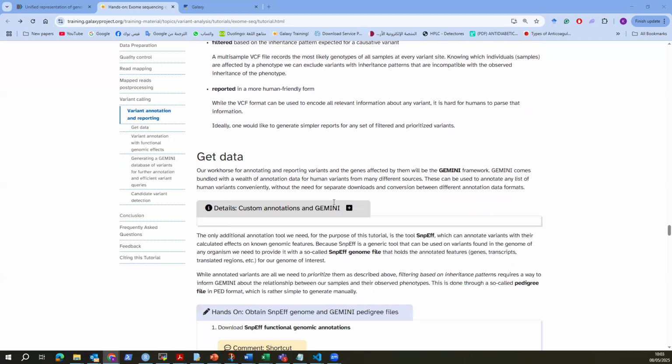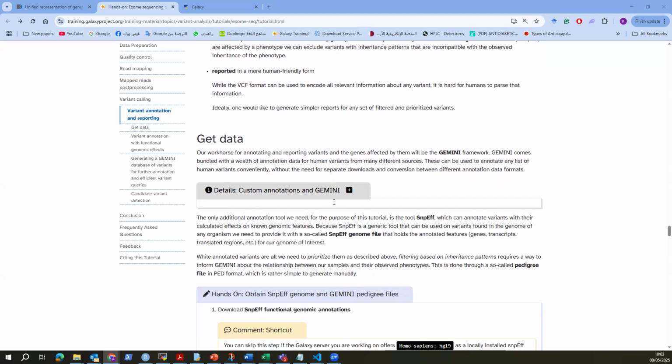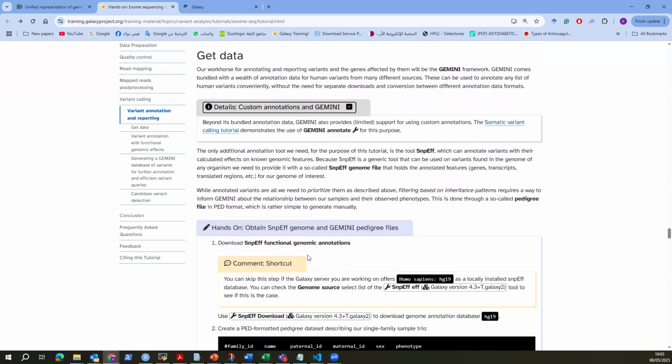And for the gene annotation, calling and manipulation, we will use Gemini. Gemini is a database that helps with annotation and extracting the data. You can go to this link for the structure of Gemini, which I strongly recommend. To work with Gemini, we can directly upload the output of the normalization, the VCF, directly.